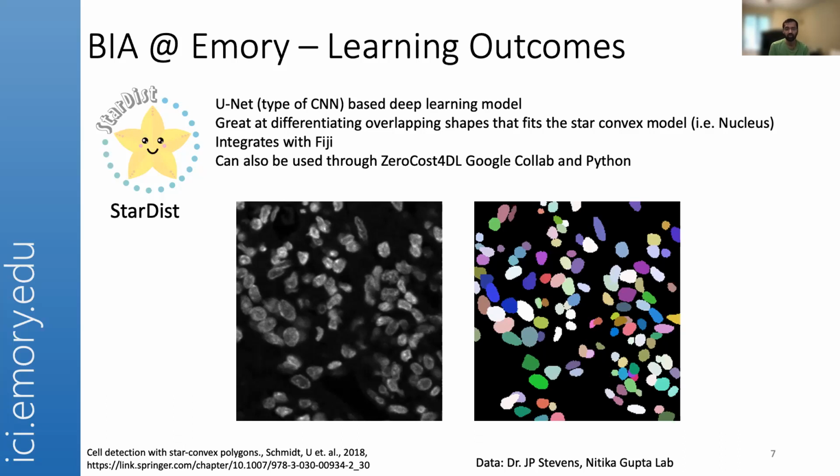The goal is to use straightforward methods which can take you from point A to point B without putting much effort into the process, right? So there are different ways of using StarDist. One is using either Google Colab or even Python, but we will be using StarDist, which integrates with Fiji, which I think everybody is okay with now.